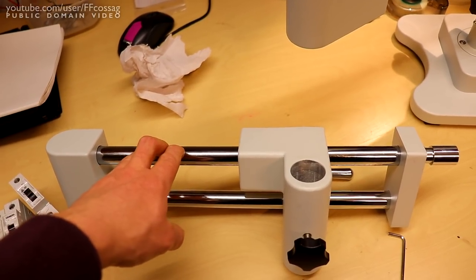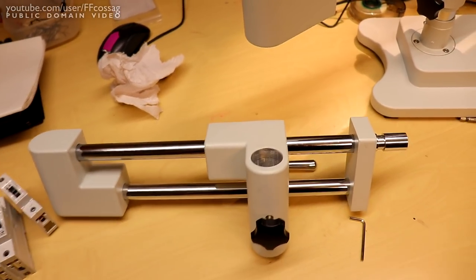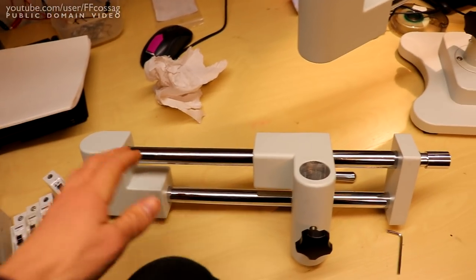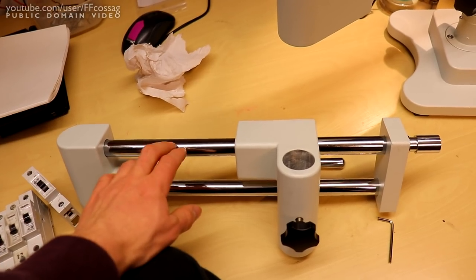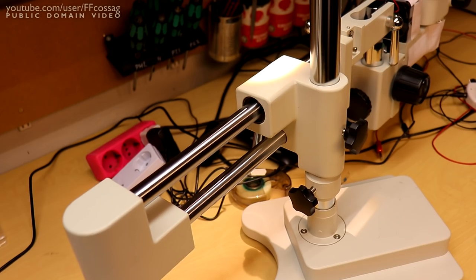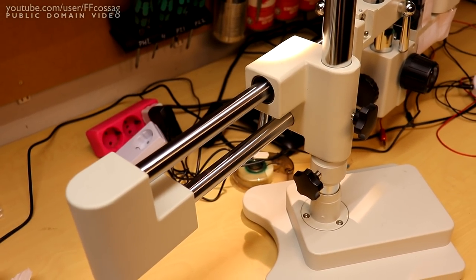So it seems they've just dropped the quality of the bearings since we got that one, and that's caused more obvious issues with the actual arm rods. And now it's even causing issues with the hardened steel rods.